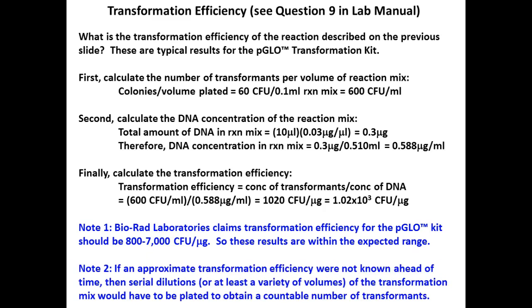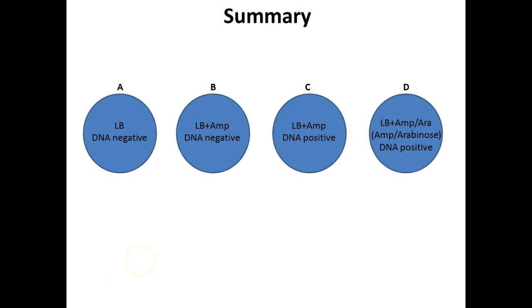So again, as I said, on average, and I haven't counted, but if anyone feels like counting today, I've got plates. We could count how many colonies they ended up with on their transformation plates and see how efficient it was this last go around. And the same holds true when you guys get your plates next week.